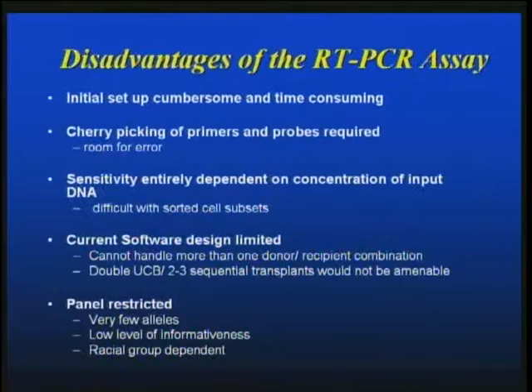So in terms of disadvantages, there's a huge number of disadvantages to this system. One is that the initial setup is extremely cumbersome and time-consuming compared to the STRs, which is a single-tube PCR reaction and off you go. There's cherry-picking of primers and probes required because they don't sell them as a kit, or they sell them as individual tubes, and you have to actually pick what it is that you're going to interrogate and maintain a profile on each donor-recipient combination and go back to different tubes constantly.